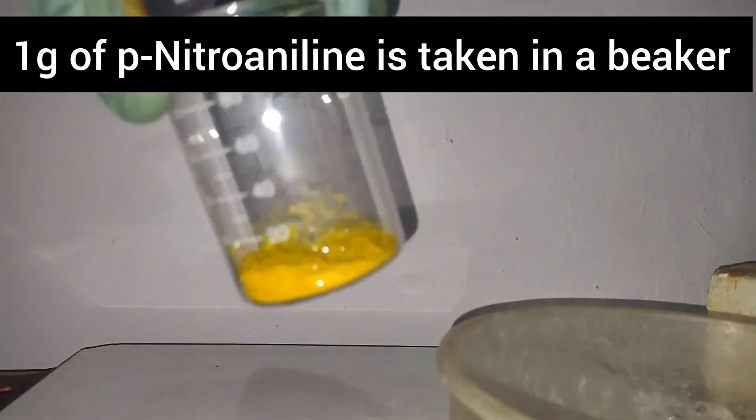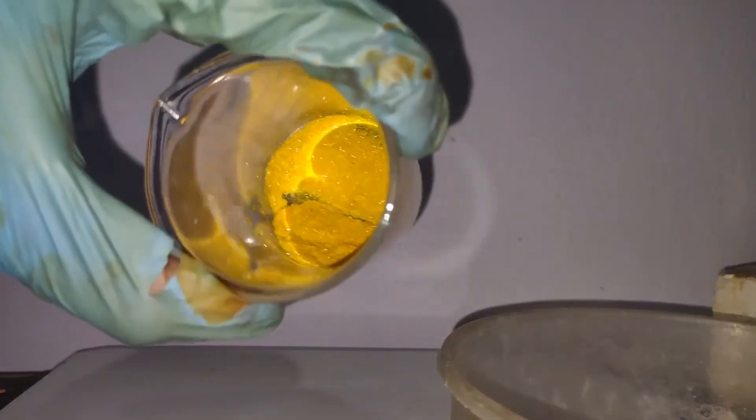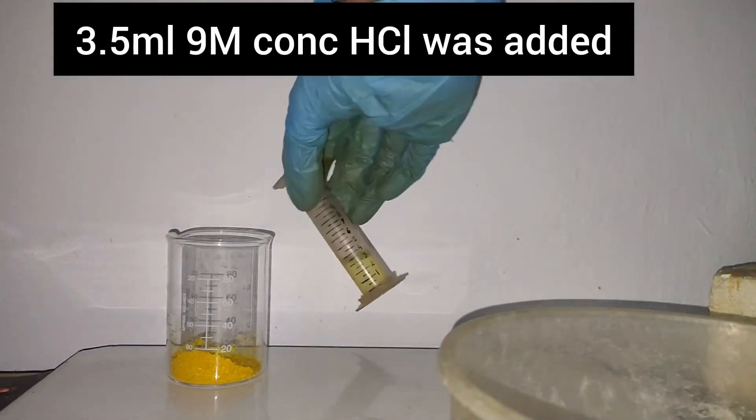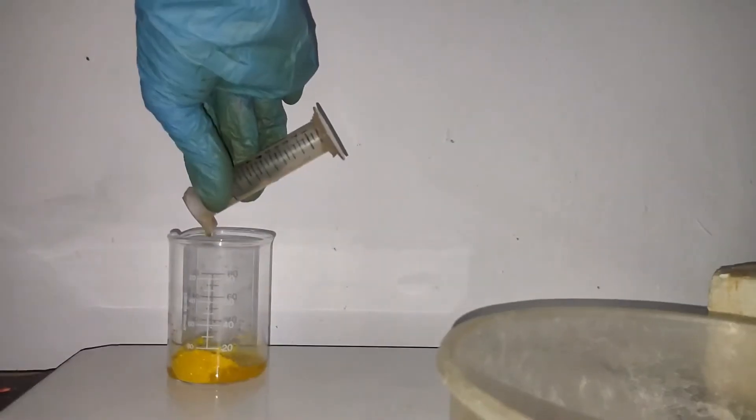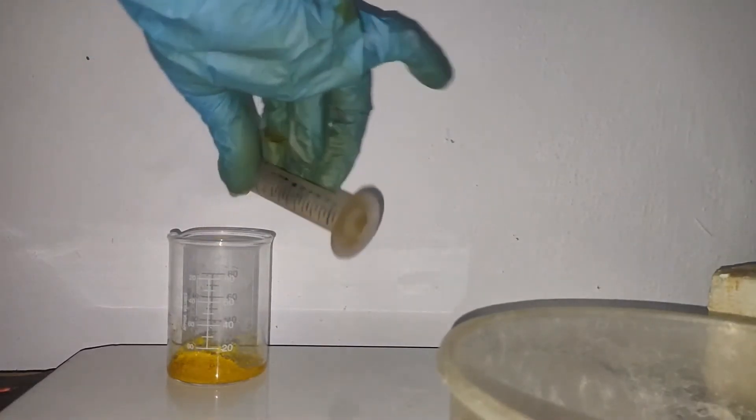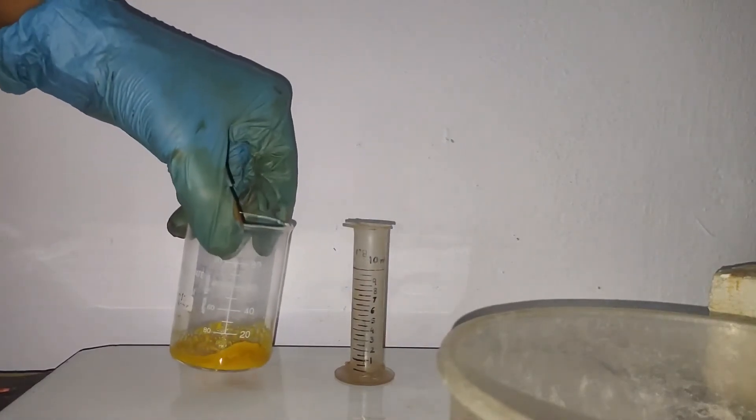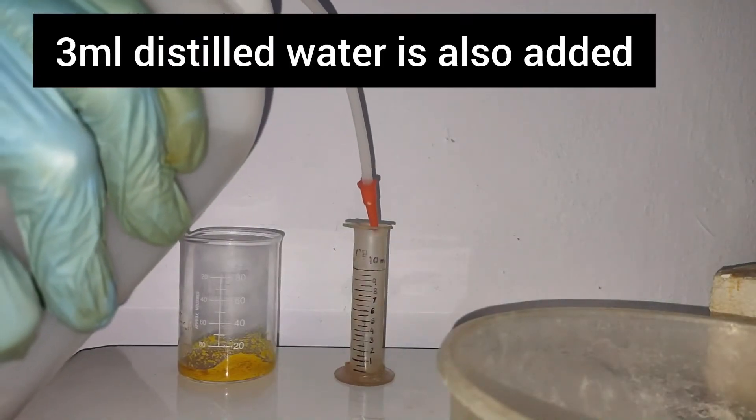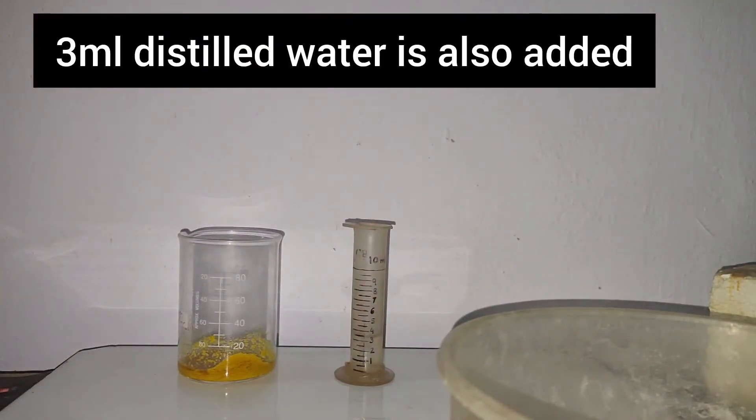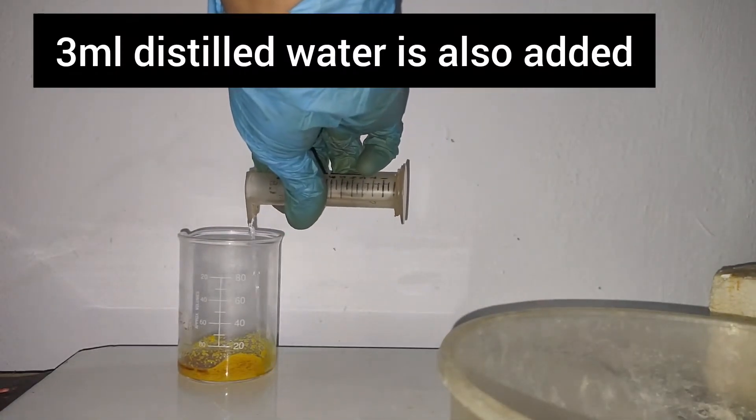First, 1 gram of para-nitroaniline is taken in a beaker. Then 3.5 ml of 9 molar concentrated HCl was added, followed by 3 ml of distilled water. The contents were shaken to dissolve everything.